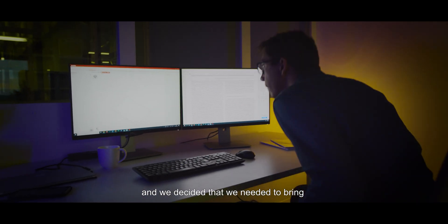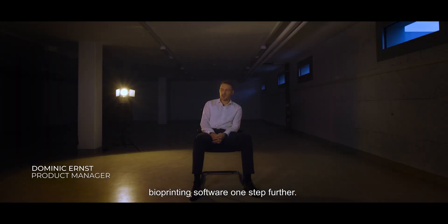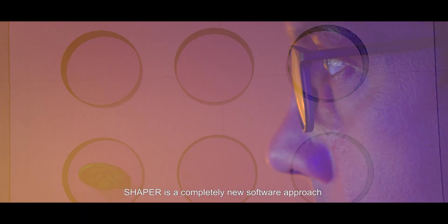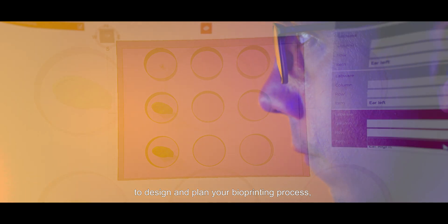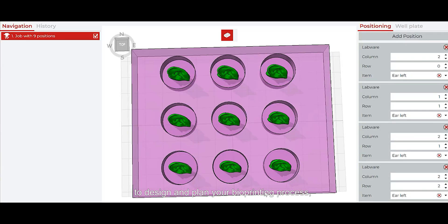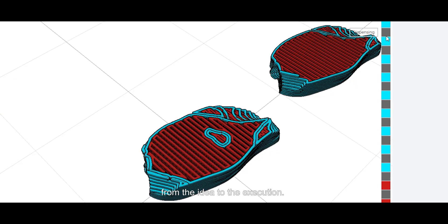We decided that we need to bring bioprinting software one step further. Shapr is a completely new software approach to design and plan your bioprinting process from the idea to the execution.